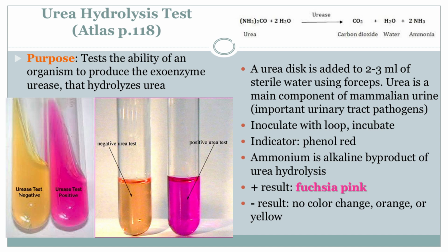So it's like adding a starter to a sourdough bread. Exactly. We give the bacteria a chance to interact with their environment, and we see what they do. And then we just sit back and wait for the color to change. Exactly. We usually give the bacteria 24 to 48 hours to incubate in the broth. Giving them plenty of time to do their thing.